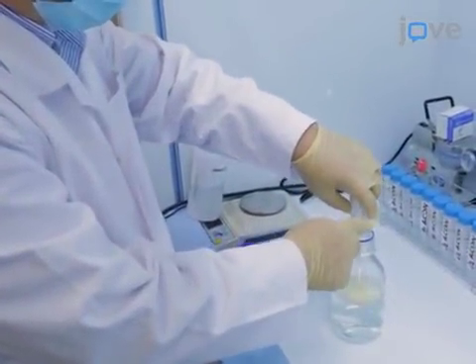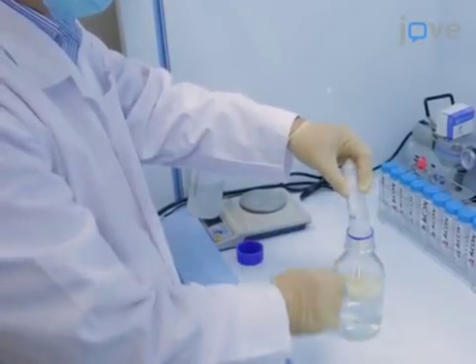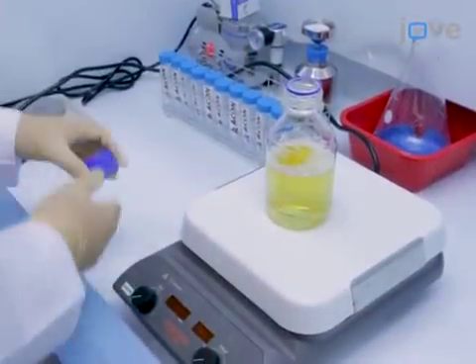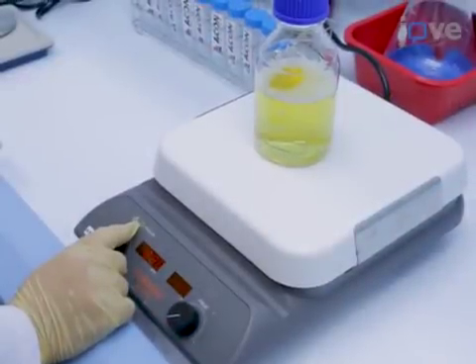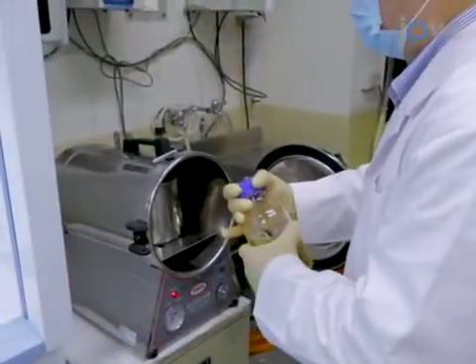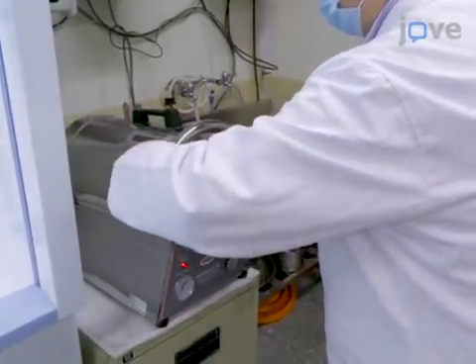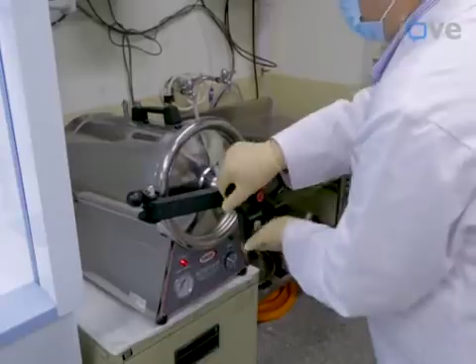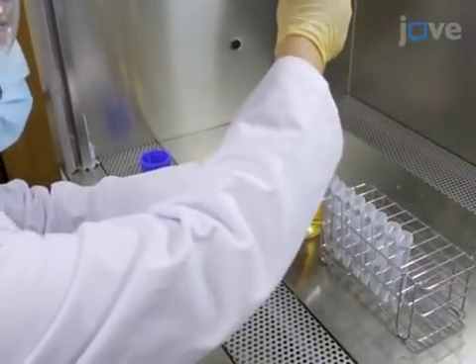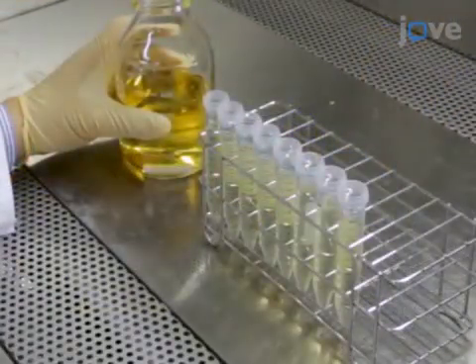Weigh out 8 grams of LB Lennox broth powder and place it into a 500ml laboratory bottle with 400ml of water. Add a magnetic Teflon stirring bar and stir the contents for 20 minutes. Cap the broth tightly and autoclave the contents at 120 degrees Celsius for 10 minutes. Allow the solution to cool down to room temperature and then use a pipette to aliquot 12.5ml of the broth into 8 15ml centrifuge tubes.